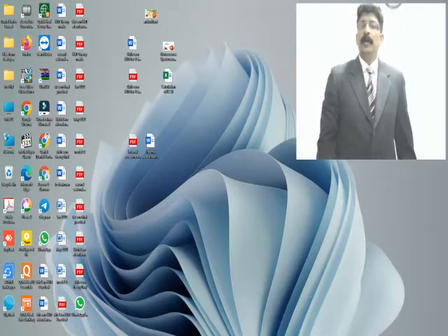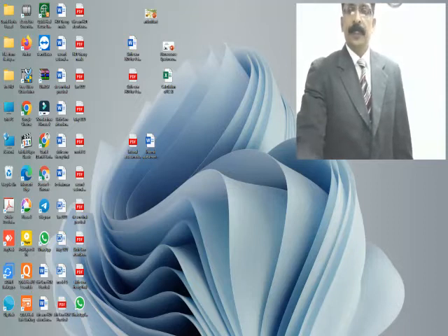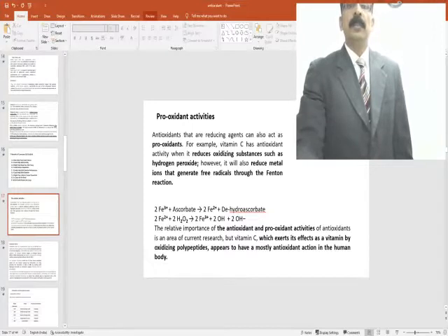Today I have taken a very important topic, which is for 8th semester students who have already completed their projects. Most of them, even most of the departments, started doing antioxidant activity of natural sources. That is the main work and also the main experiment which has been carried out by most of the students in this project work.